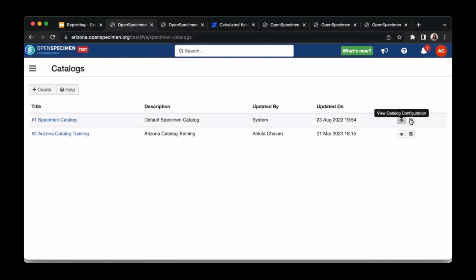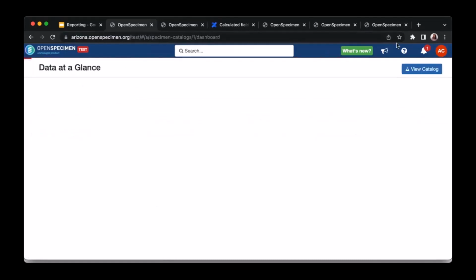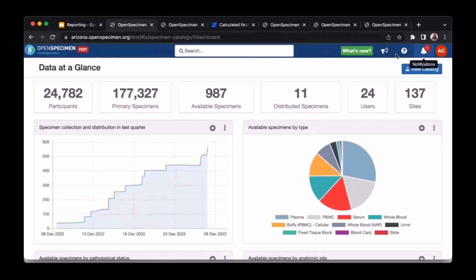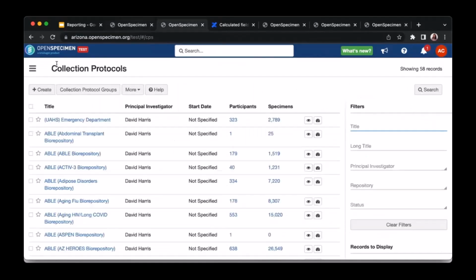Okay. So this is the default dashlet. And you see these are the buttons. As I'm currently logged in, I can see there's no sign in button, but if I had not logged in, there would be a sign in button present here.